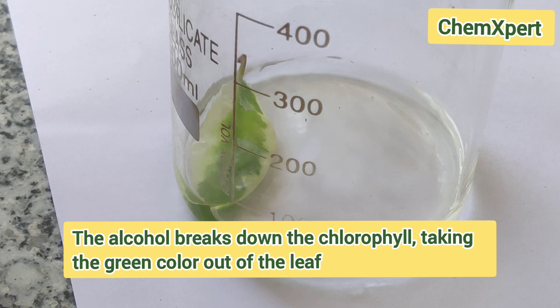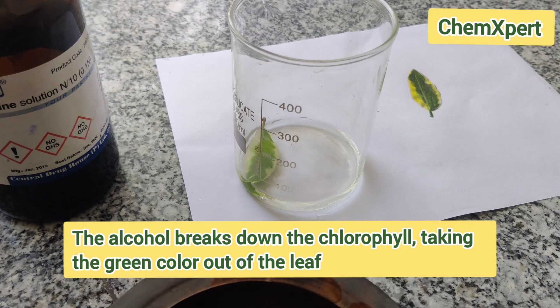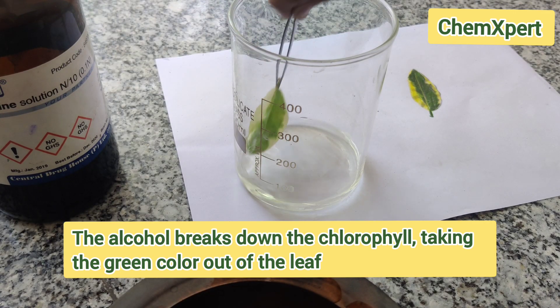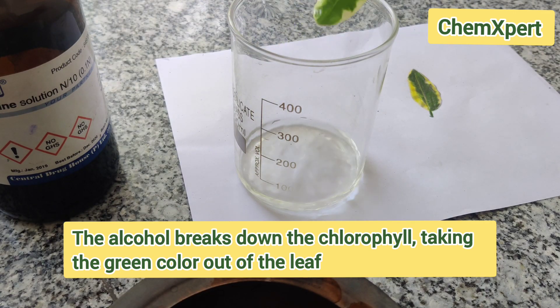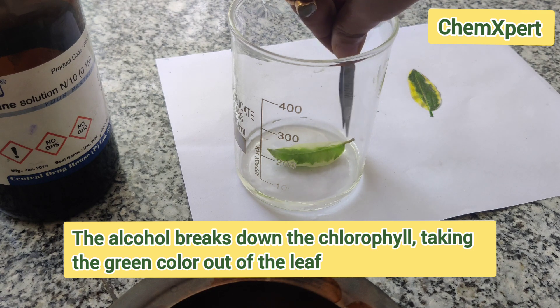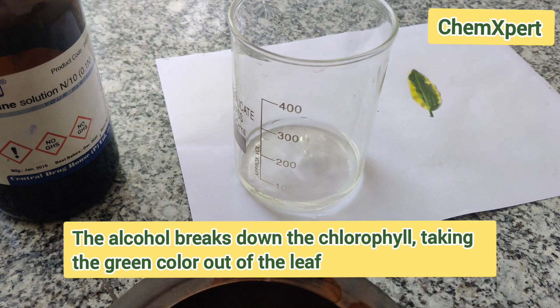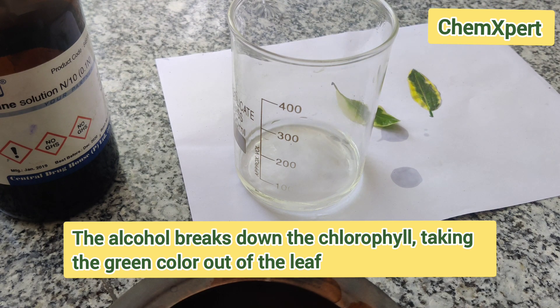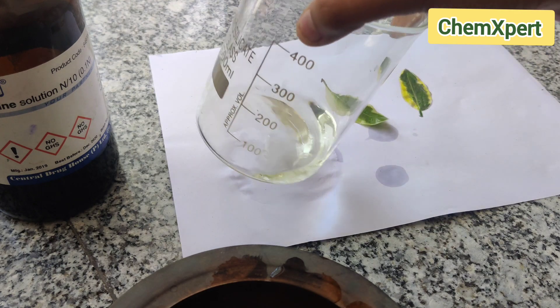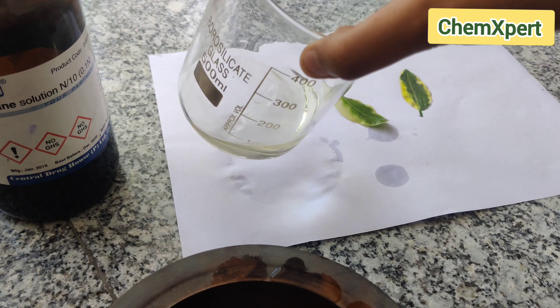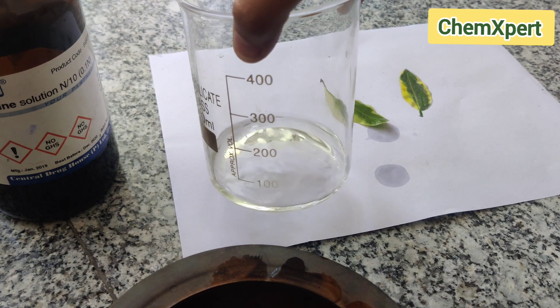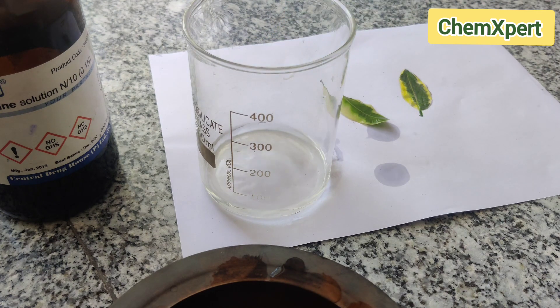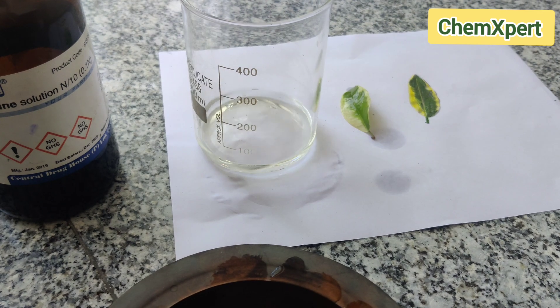You can observe that the solution becomes slightly green in color. When we remove the leaf from the alcohol solution, the solution changes color — initially transparent, it becomes light green because it now contains chlorophyll.